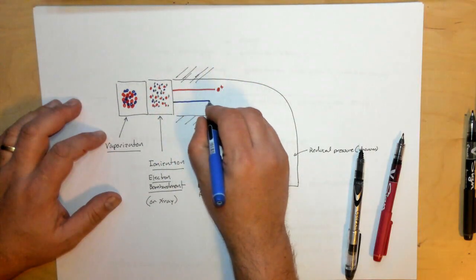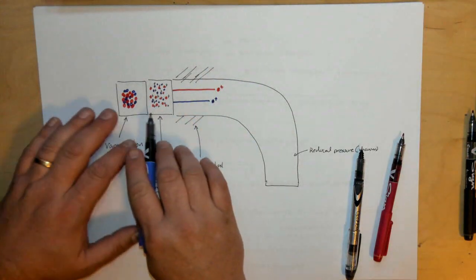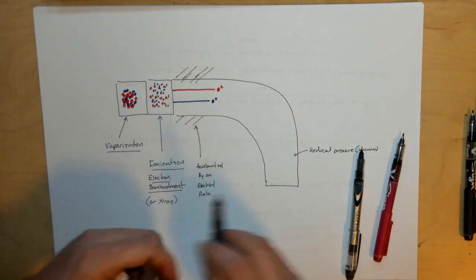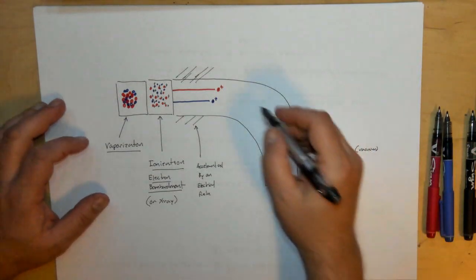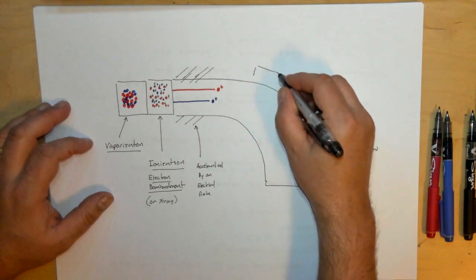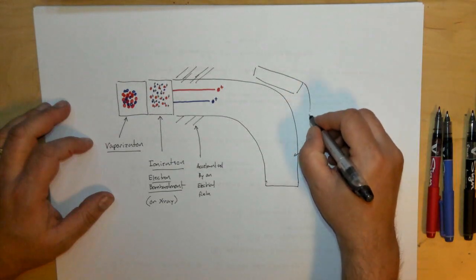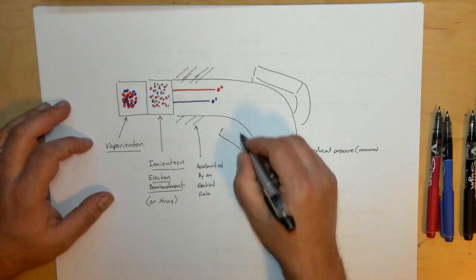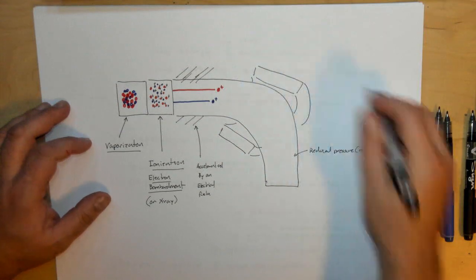Now I'm only going to illustrate two of them, obviously, at a time. But when this is normally occurring, all of them are moving, right? So you have hundreds of these, if not thousands, and in some cases millions of them, depending on the size of your sample. Now, as they go barreling down this tube, literally, what they encounter then is a magnetic field. And I'm going to draw the magnetic field as if it were like a big horseshoe magnet here. And we can draw it like this, right? And so we have this magnet.